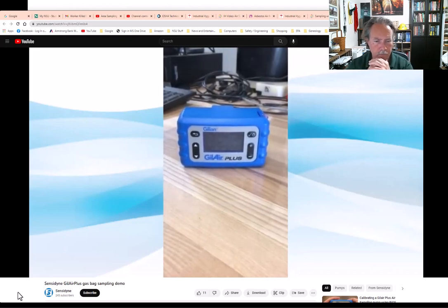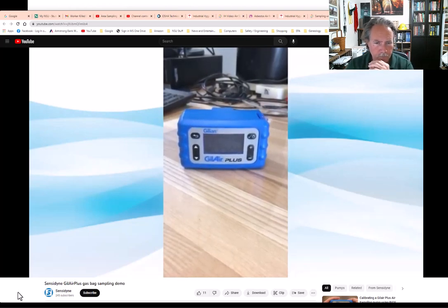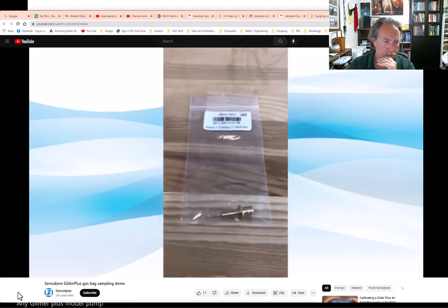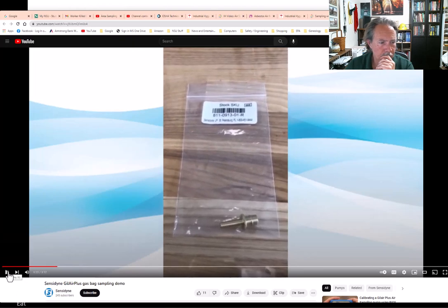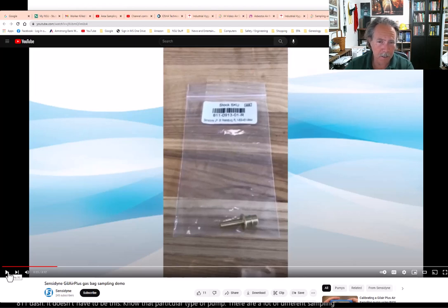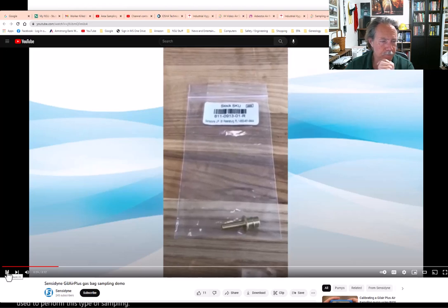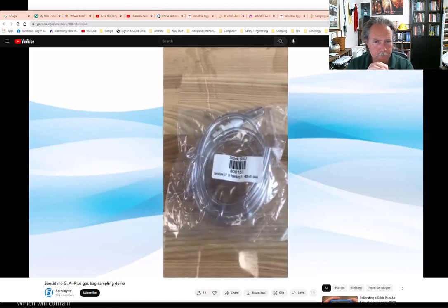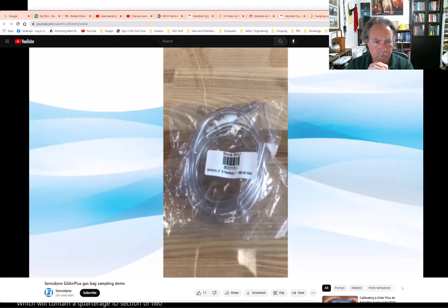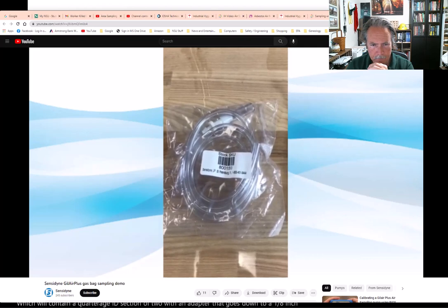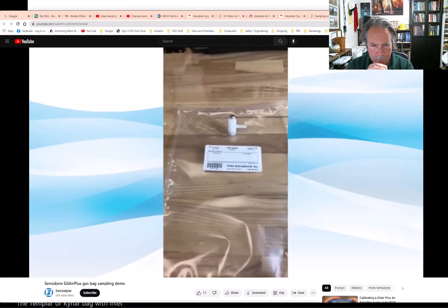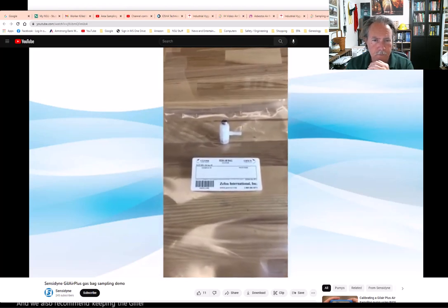Today we are going to demonstrate a bag fill operation using a Gillair Plus pump. You will need the following materials: any Gillair Plus model pump with an output adapter, a tubing assembly kit containing a quarter inch ID section of tube with an adapter down to one-eighth inch tubing, and a Tedlar or Kynar bag with inlet valve. It doesn't have to be that specific pump — there are a lot of different sampling pumps that can be used to perform this type of sampling.